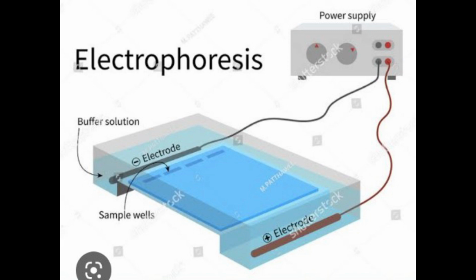Slide preparation. About 0.4 ml of warm agar solution is delivered onto the slide uniformly at room temperature and allowed to solidify for 20 minutes before starting the experiment. Both buffer tanks of the electrophoresis chamber are filled with an equal volume of 0.05 molar barbiturate buffer, pH 8.6, and kept closed to saturate the chamber with solvent vapor.